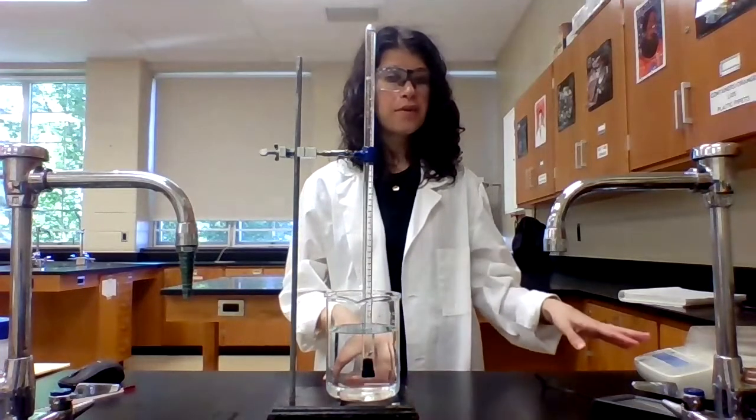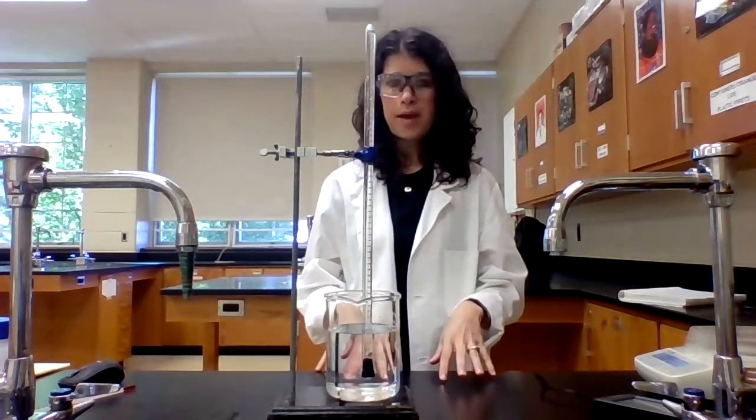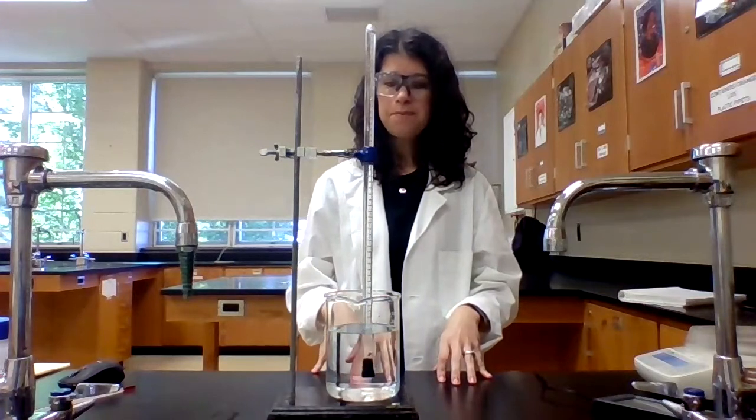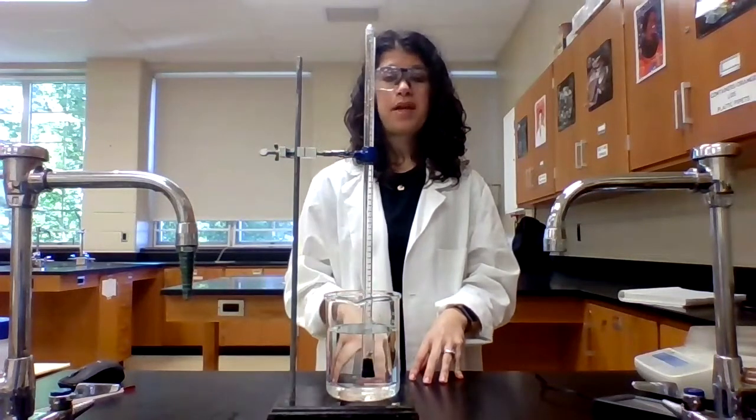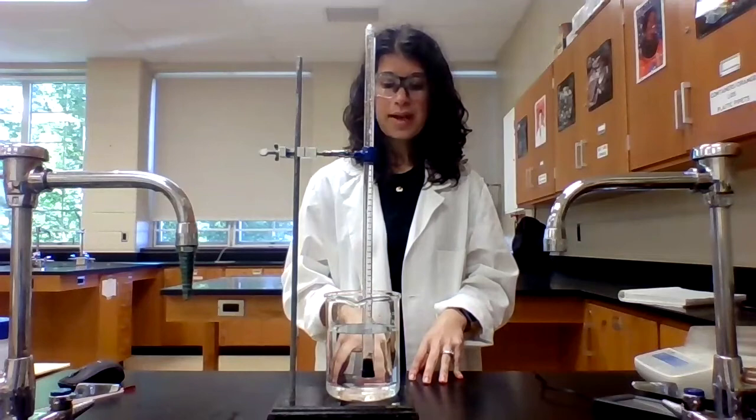So the mass of the magnesium ribbon, that's where we're going to be starting all of our calculations from. So I need to ensure that all of that magnesium ribbon has reacted. So we're going to let this go until we see the bubbles stop evolving, and even then give it another 5 more minutes, just to ensure that all of the magnesium ribbon has reacted with the hydrochloric acid.